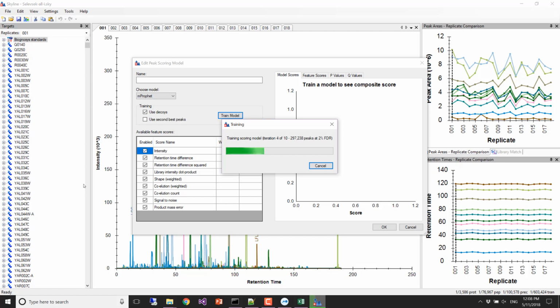So actually, if you look at the number of peaks below a 2% FDR, it's not that much higher than with the low CV case. But it's taken quite a few iterations to work out this model, and now it's got to calculate the scoring contributions.